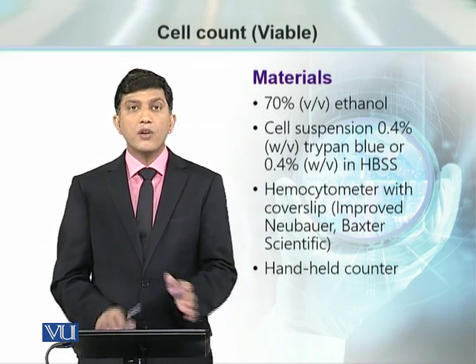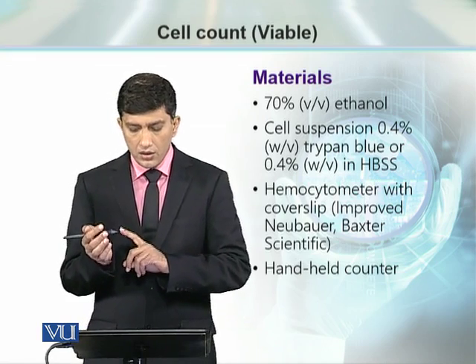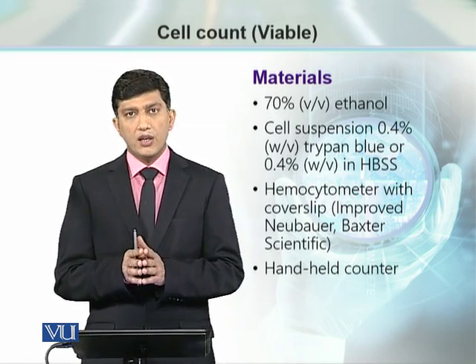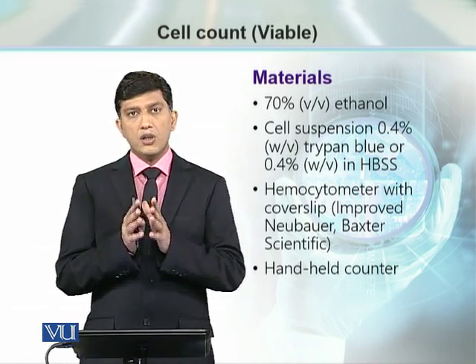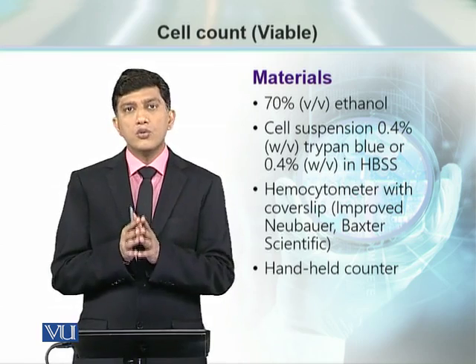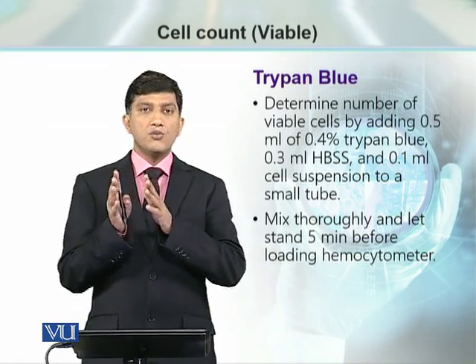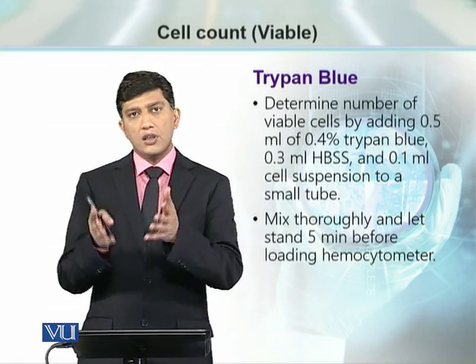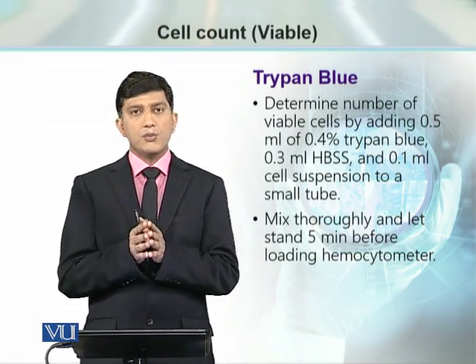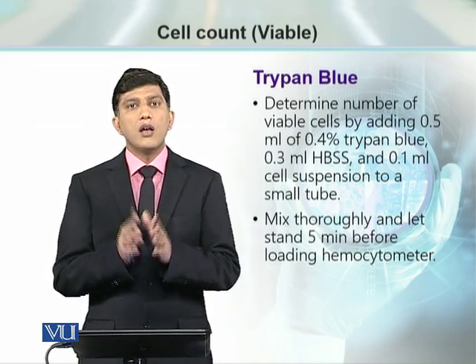फॉर दैट पर्पस व्हेन वी मिक्स द सेल पॉपुलेशन, बैलेंस्ड सॉल्ट सॉल्यूशन and we mix the trypan blue, let it settle on the bench for 5 minutes. In 5 minutes में what is going to happen, जो trypan blue है, it will enter through the plasma membrane into the cells. अब जब हम 5 मिनट की इंक्यूबेशन के बाद सेल्स को हेमोसाइटोमीटर में लोड करते हैं, तो हमें दो किस्म के सेल्स विजिबल होते हैं. दो सेल्स which are stained blue and the other cells which are unstained.